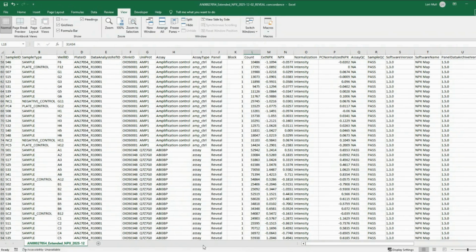The Olink ID links the lot number of the Reveal panel to the specific library of antibodies that was used to make it. The UniProt ID is the true name of the specific target protein. Note that the Olink internal controls do not have UniProt IDs. Assay indicates whether it is a control or the gene name. Assay type indicates the specific type of control or an assay.